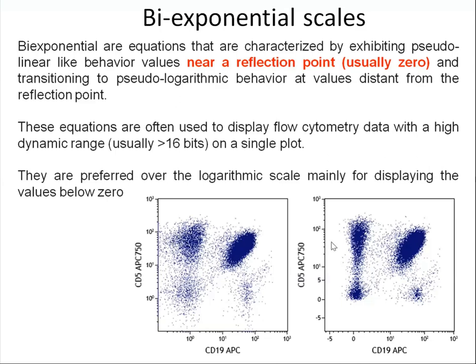This population comes inside. Now you can see the entire population clearly within the scale, because now this area becomes linear, so all this population will be coming inside. Okay, and this is all the same as logarithm. Here it's almost the same. Only in this area it will be a linear scale. Now this is very useful when the data values are below 0.